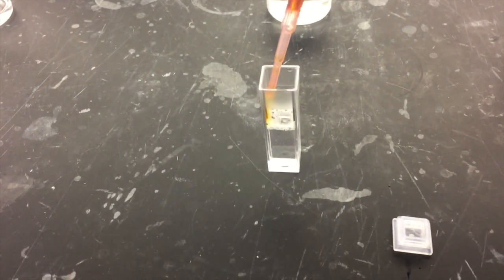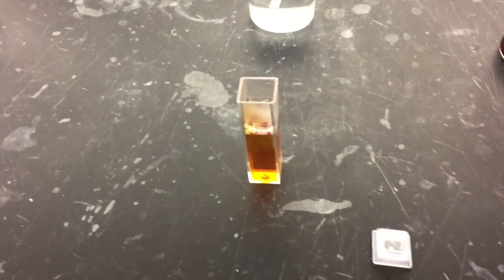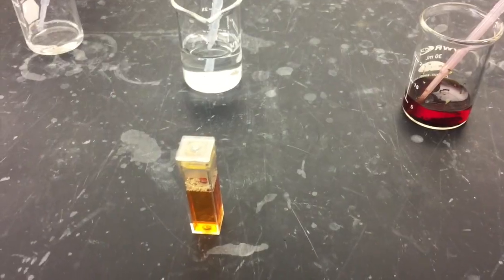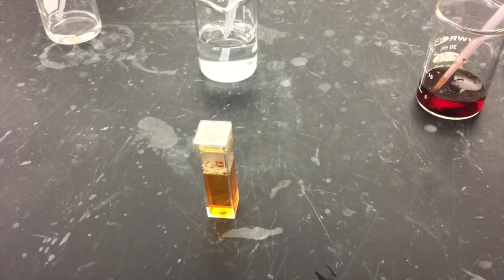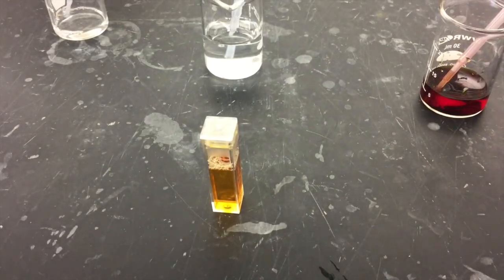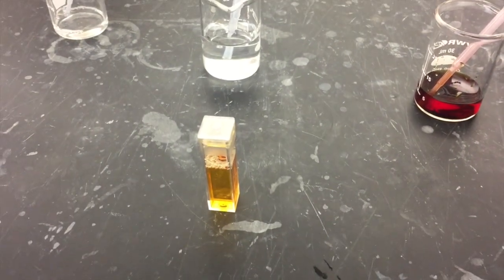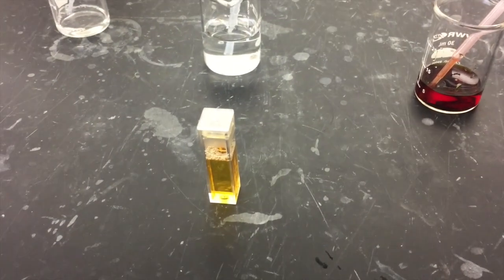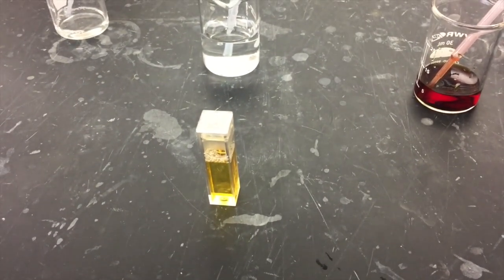As this reaction progresses, the color of the solution will gradually fade. That's because triiodide is colored red and it's consumed in the reaction. So you'll see that the absorbance will decrease over time. If you were to look at the cuvette outside of the spectrometer, you would see that the color is gradually fading away.